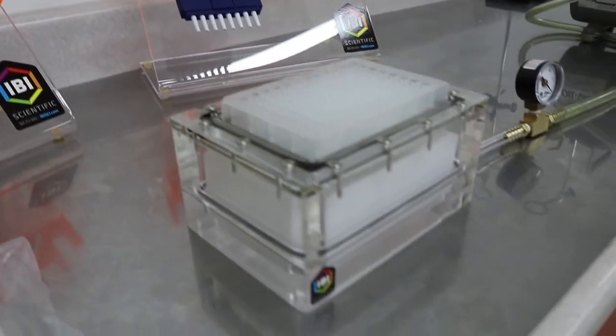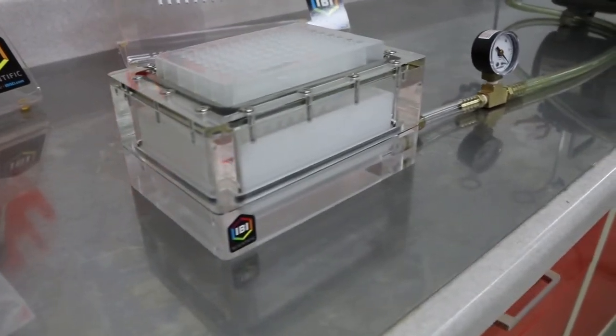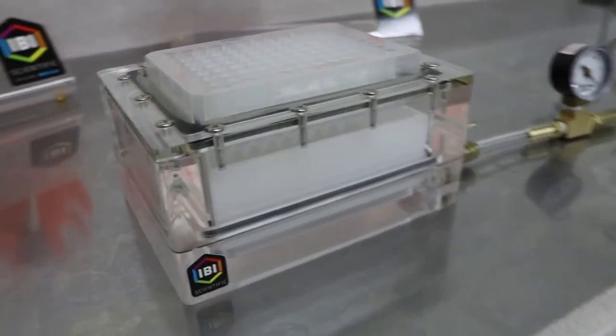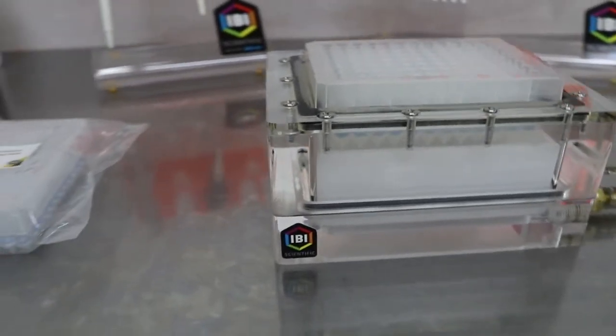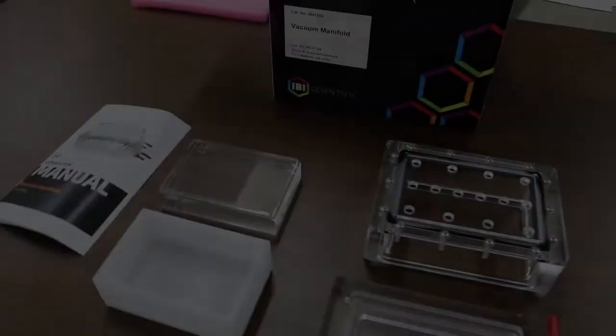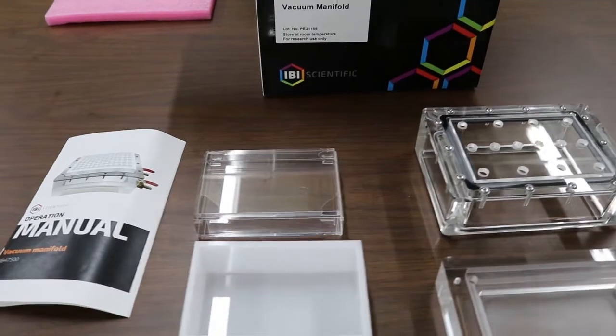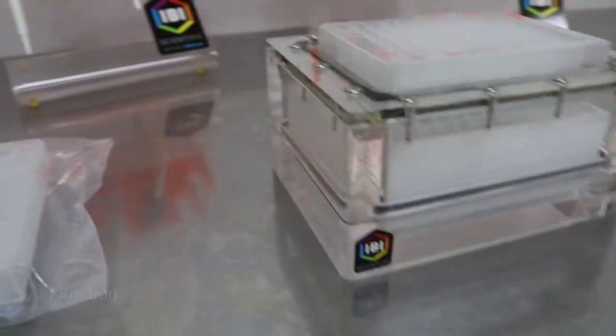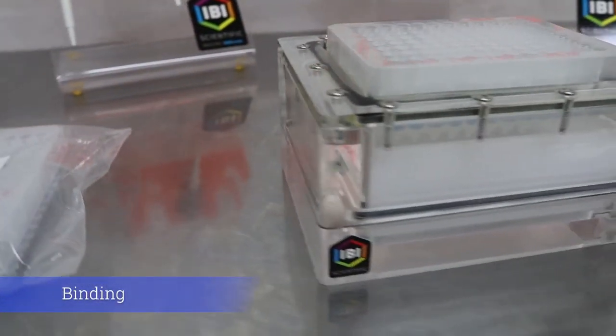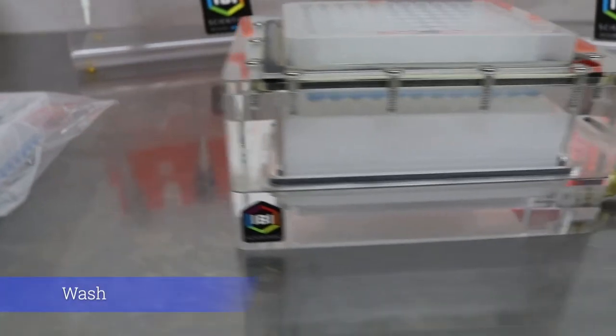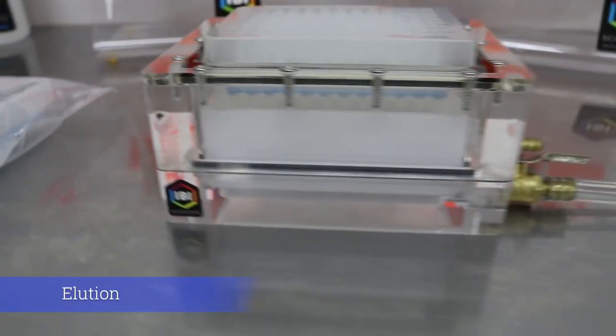Today we will show you in only a few minutes how you can quickly and effectively use IBI Scientific's vacuum manifold to perform a 96-well plate extraction. Most 96-well plate extractions require a binding step, a wash step, followed by an elution step.